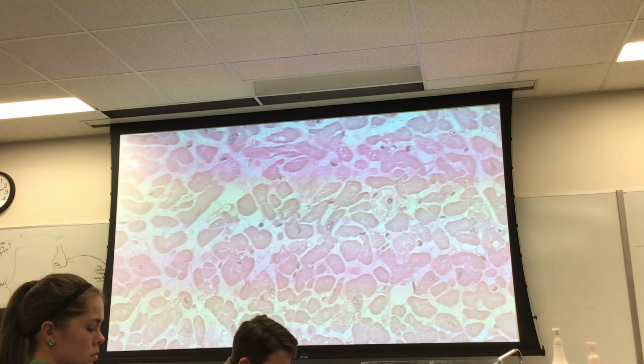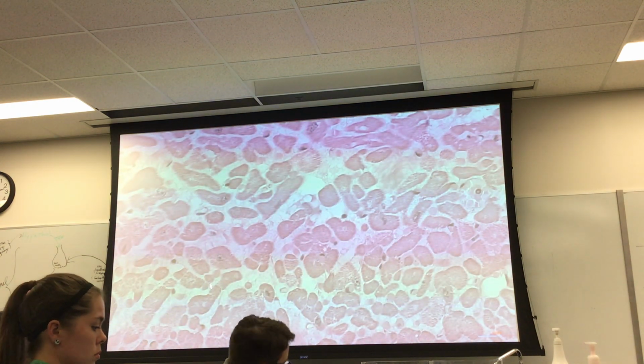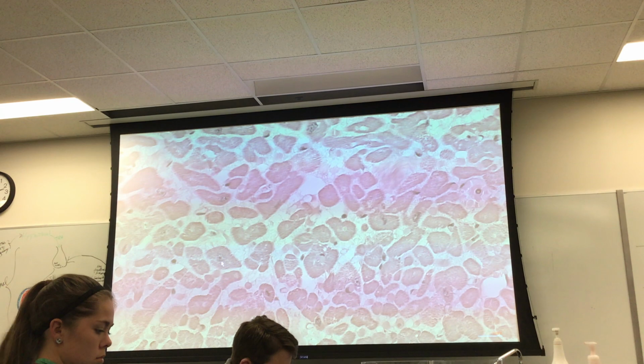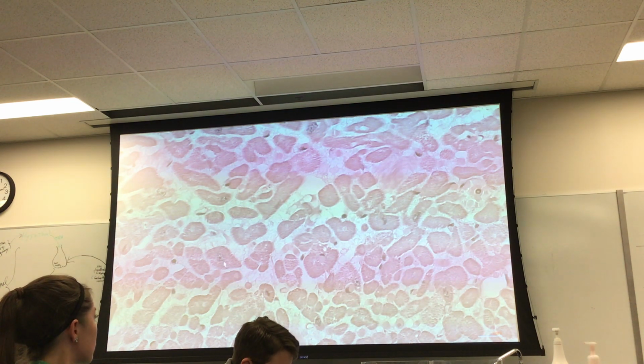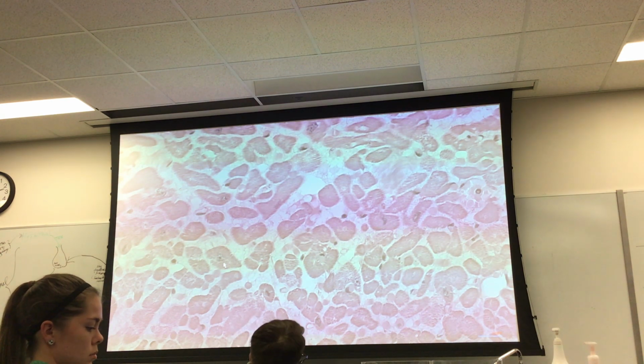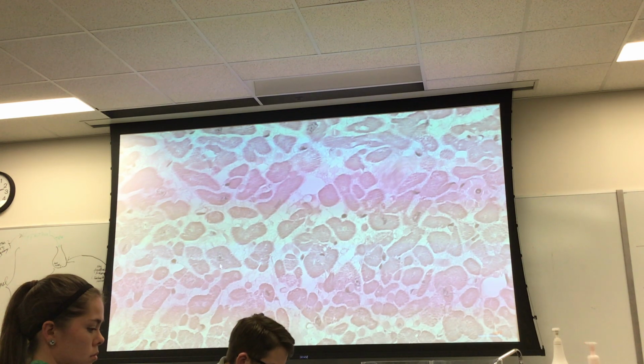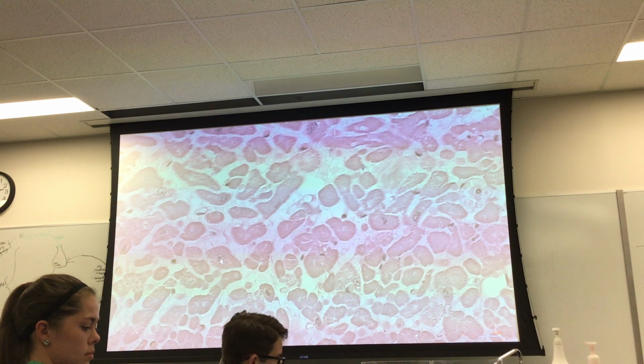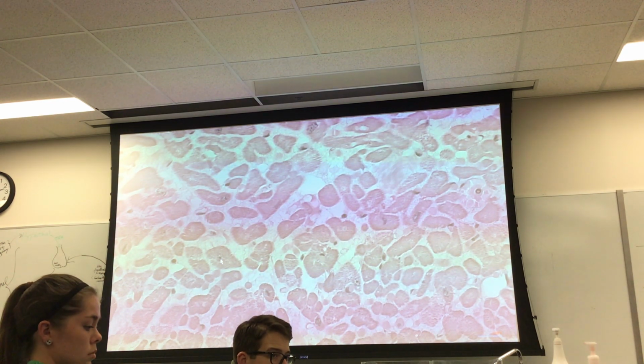Cardiac muscle looks like this. One of the key features is its centrally placed nucleus. That's how you immediately distinguish it from skeletal: peripheral nuclei for skeletal, centrally placed for cardiac. What makes this not smooth muscle in cross section is that there's sufficient cytoplasm surrounding the nucleus. So it's a centrally placed nucleus, but the nucleus doesn't fill the entire cell profile. So for the muscle types, make sure you can see them in the two orientations.